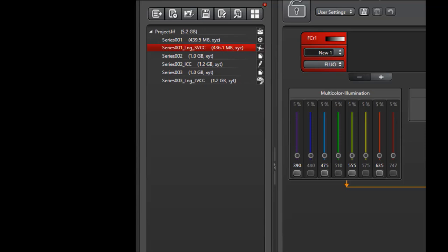If you happen to be imaging with a Leica Thunder system, there is some additional nomenclature that can help you reference files. SVCC, LVCC, and ICC indicate the type of algorithm being applied, whether it's small volume computational clearing, large volume computational clearing, or instant computational clearing. Again, these only apply to Thunder systems. All of these naming conventions help you quickly identify the images you want to observe from the list of images.